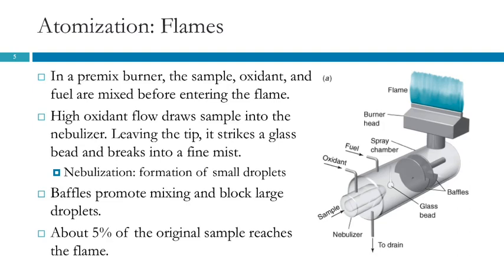Any other questions? Is there a reason why acetylene is used? There are different combinations of fuel and oxidant that are used. Some of it has to do with what's more convenient. Air is very convenient to use because it's just all over the place, right? Sometimes you need to use oxygen, and that is a little more hazardous. Acetylene is very flammable. Obviously, you need something flammable, or you won't have a flame, right? But different mixtures will burn at different temperatures and have different properties.